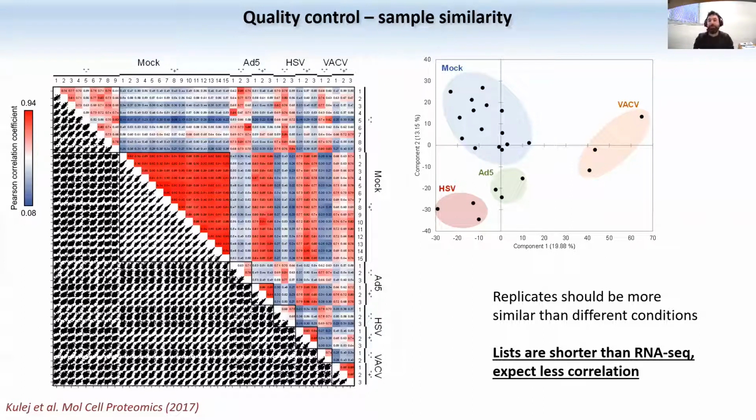Now, without going into much detail, this type of data representation basically puts close to each other samples that have an overall higher correlation by looking at multiple properties of the data. And you can use this, for example, to tell which samples are the most similar to each other, and are there groups of samples that affect more my proteome.